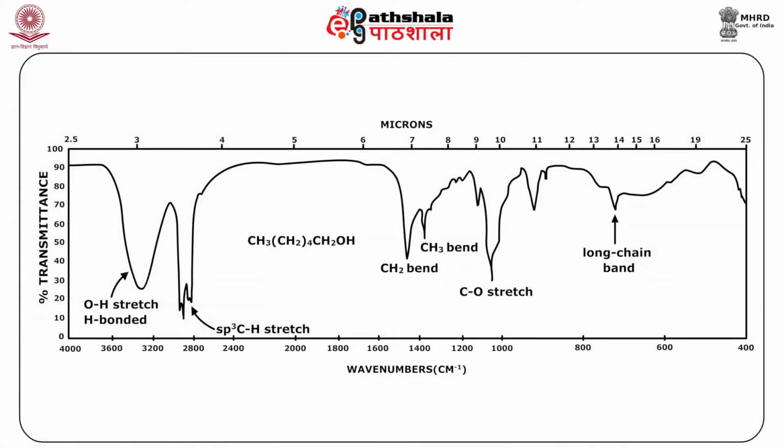Alcohols and phenols produce characteristic infrared bands due to O-H stretching and C-O stretching in the regions 3200 to 3650 centimeter inverse and 1000 to 1260 centimeter inverse.